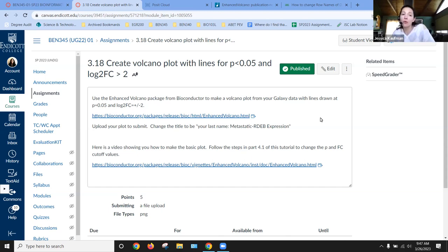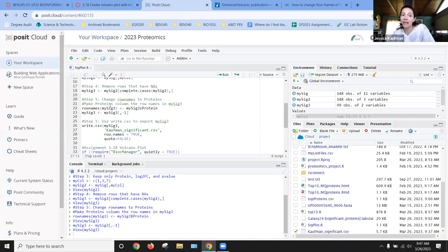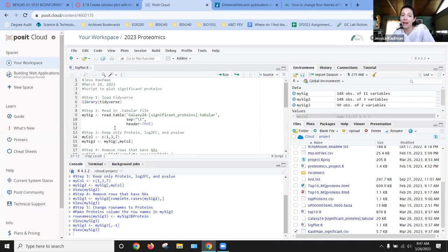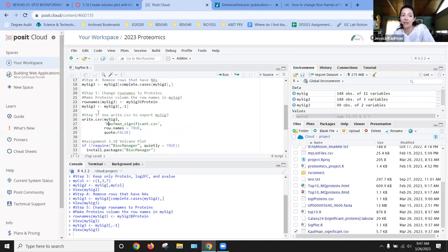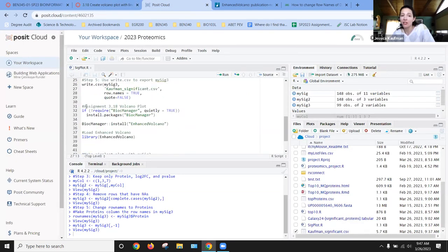So we're going to start with the same script that we had for step 3.17. We'll just add a couple of lines for assignment 3.18.